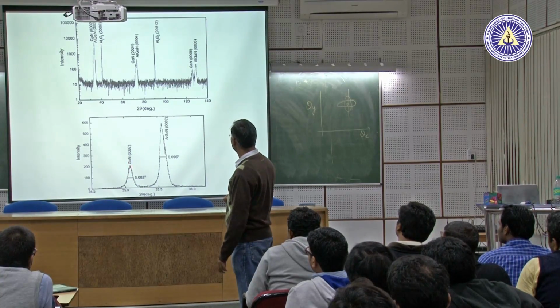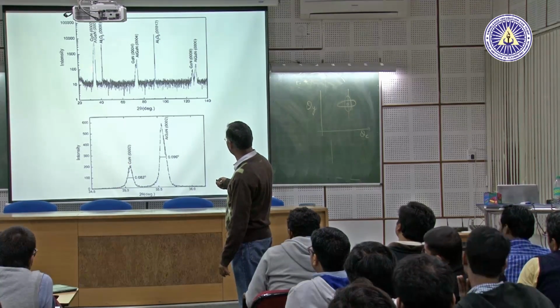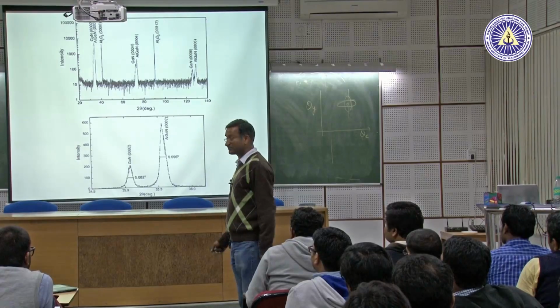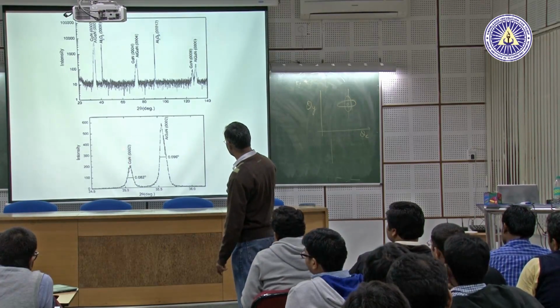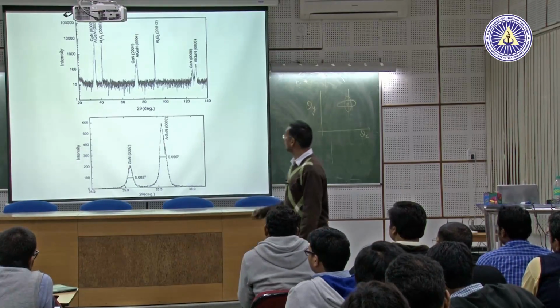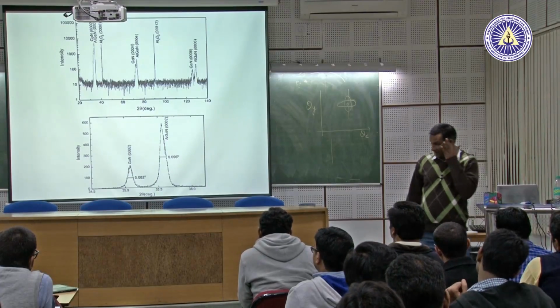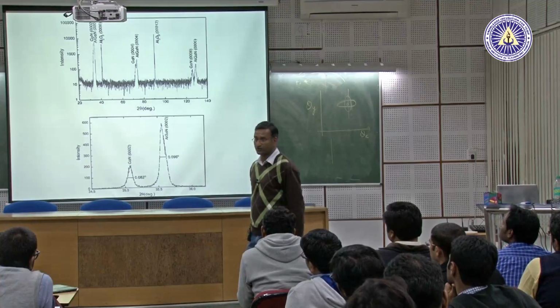Okay, because here the 002 peak will be somewhere here, and it's just merged with the 002 peak of aluminum gallium nitride. It could be because the thin film thicknesses are different. It's in this fashion because the gallium nitride 002 is for the film which is much thinner than the aluminum gallium nitride thin film. So this is a thicker film, this is the thinner film. That is why you have a separation in the intensity. But if you don't do a 2 theta omega measurement, you only see a single peak. You don't see the two peaks.